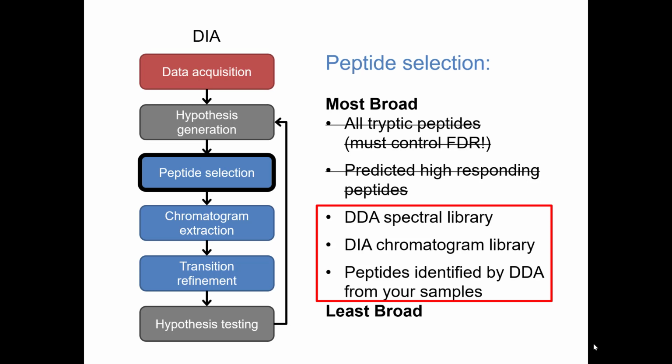But yes, as I said, if you're trying to analyze DIA data for peptides blindly without any additional information, it can oftentimes be pretty hard to make the call as to what is a true signal and what is a false signal. Does that seem reasonable? Okay, cool.